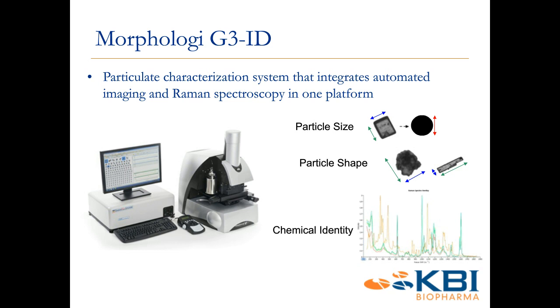It's able to give you the same kind of information that MFI would, where we're getting images of particles and we can get a lot of shape factors out of those images with the software. But now we also have that Raman spectroscopy, so we're actually able to get after the chemical identity of these particles. And the laser's around 3 to 5 micron in size, so we're looking at single particle detection here, which has been very valuable for us to understand particle profiles in the subvisible size range.